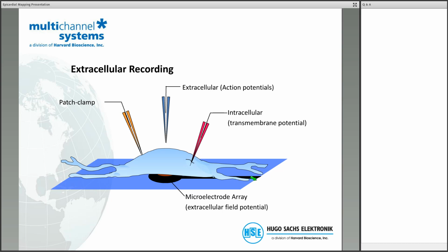So in our in vitro setup, we have electrodes embedded into the surface of a glass substrate, and you culture the cells on top. What we are doing here is we transfer the grid of electrodes, the array of electrodes, from a very stiff glass substrate to a flexible polyimide substrate.